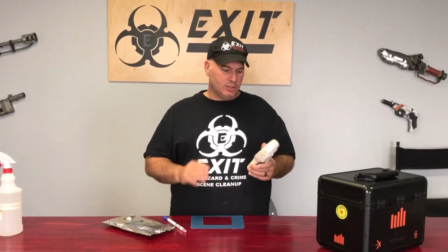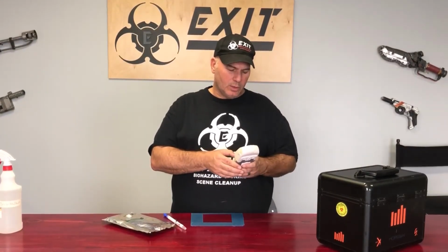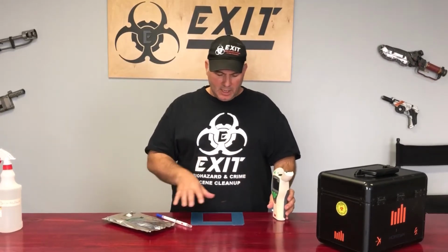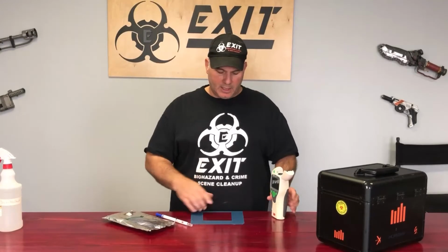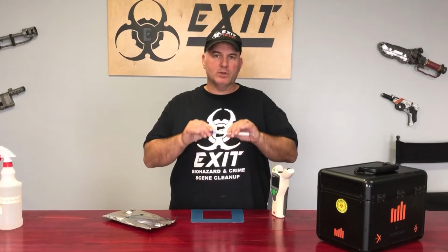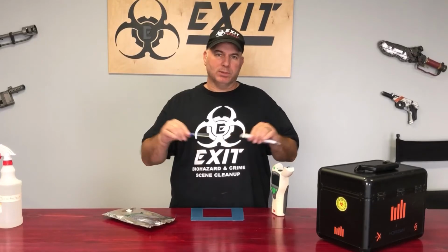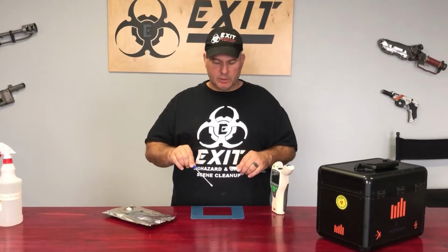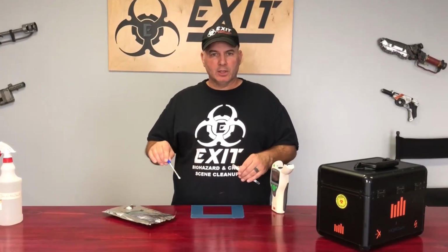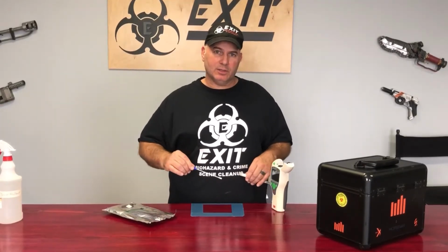Okay, so let's try it just to show you what we're dealing with here. I'm just checking on what we've got here. We're going to generate a sample. I don't know if you can see this, but I've checked out a 4x4 inch square here, and that's what they suggest to use. When you're using a swab like this, you don't take it out unless you're ready to use it. When you apply it, you want to apply enough pressure to put a bend in it when you're rubbing it on a table. What you want to do is go within a 4-inch square, zigzag in one direction, and then zigzag in the other direction.